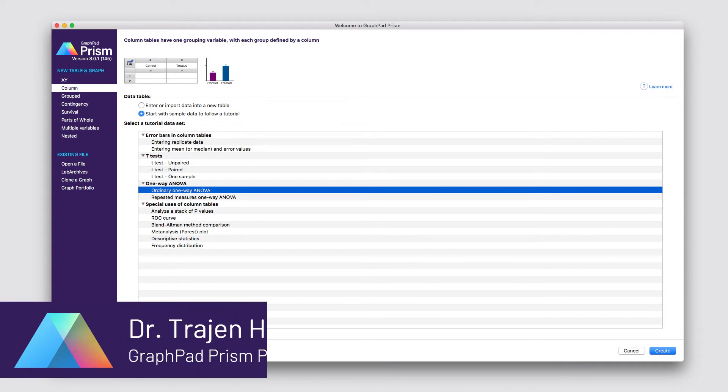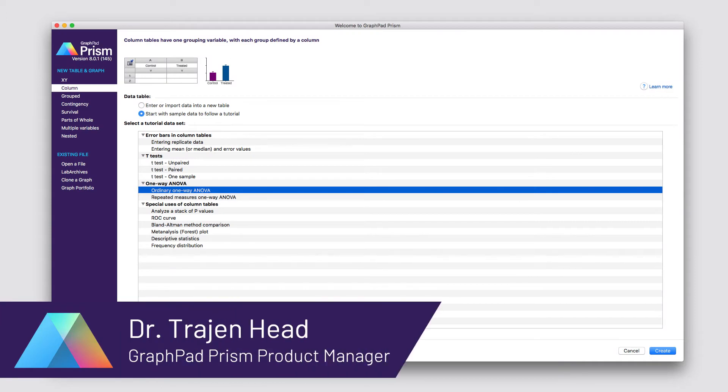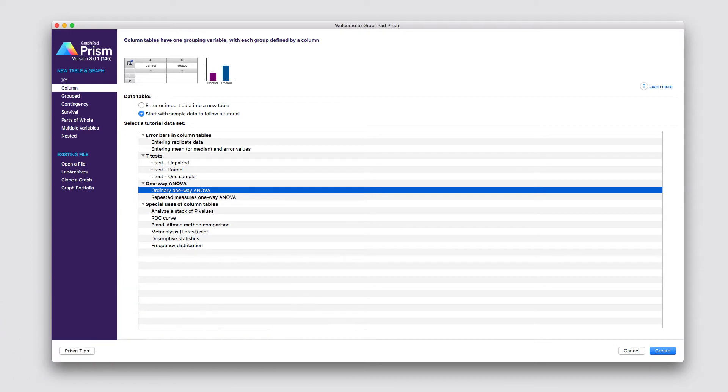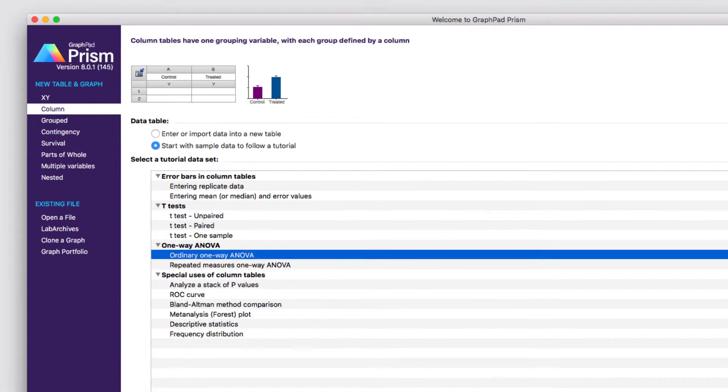Hello and welcome. My name is Dr. Trajan Head, and I'm the product manager for Prism at GraphPad Software. What I'm going to show you in this video is just a really quick tip on how to find and navigate results of analyses when those analyses generate multiple sheets of results.